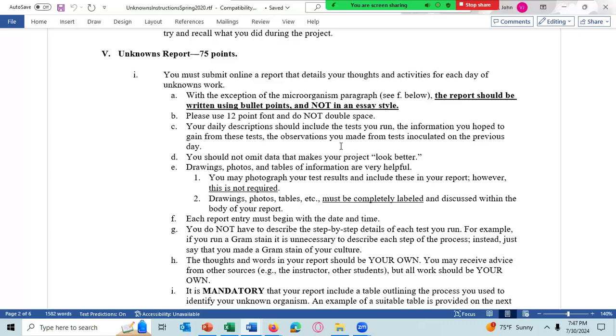Like your observation is the test tube is yellow, or the test tube is something else like pink. If the test tube is yellow, your conclusion is that that test was positive, like in the PR inulin test. With PR lactose, you've got to say whether it's actually AG or A or negative, meaning that one is not a yes or no answer.